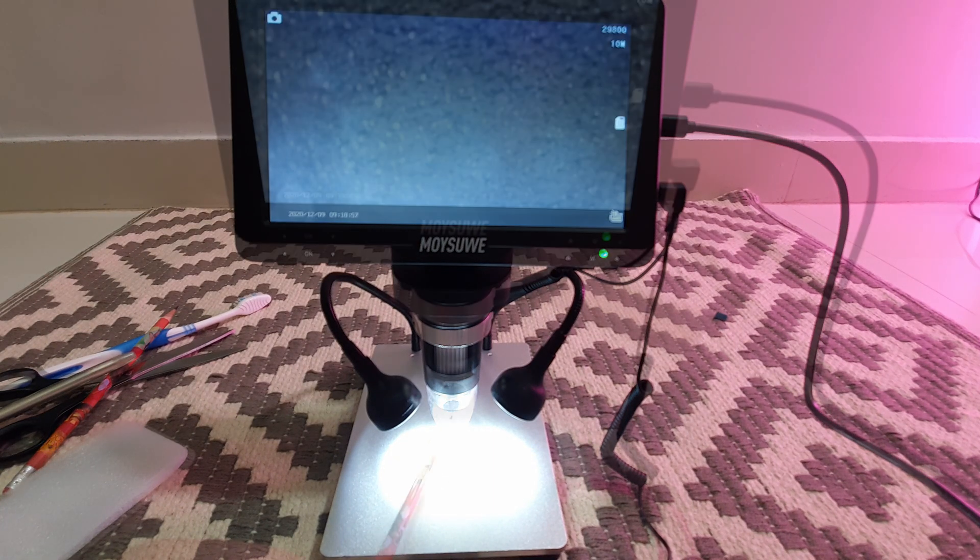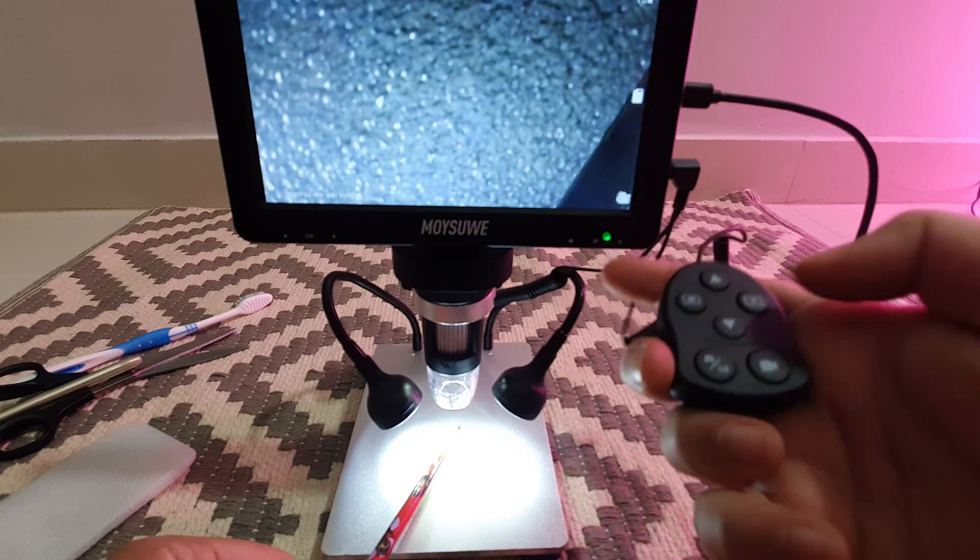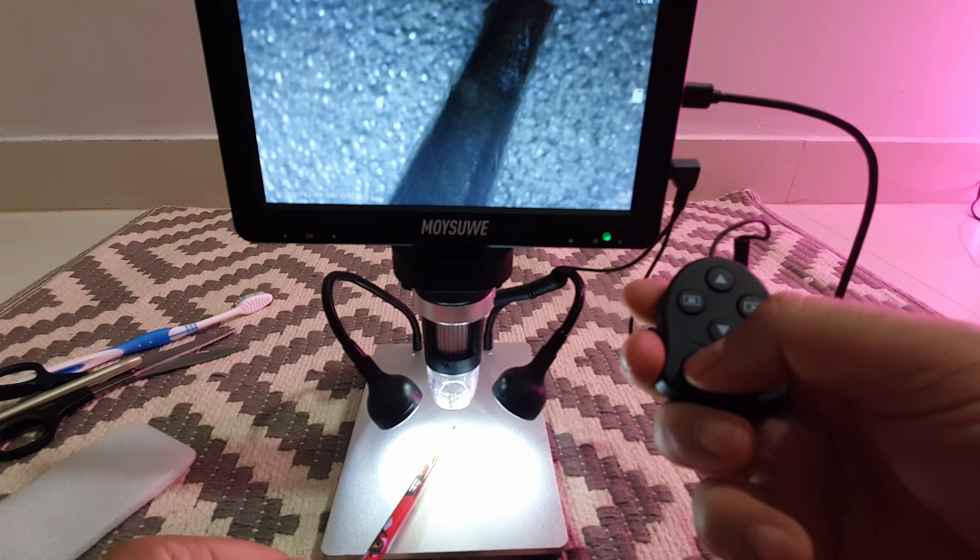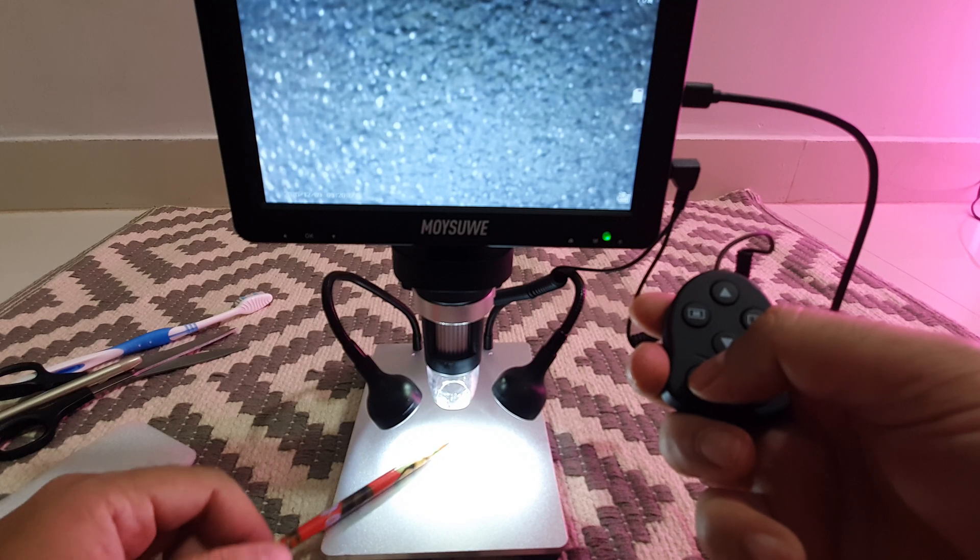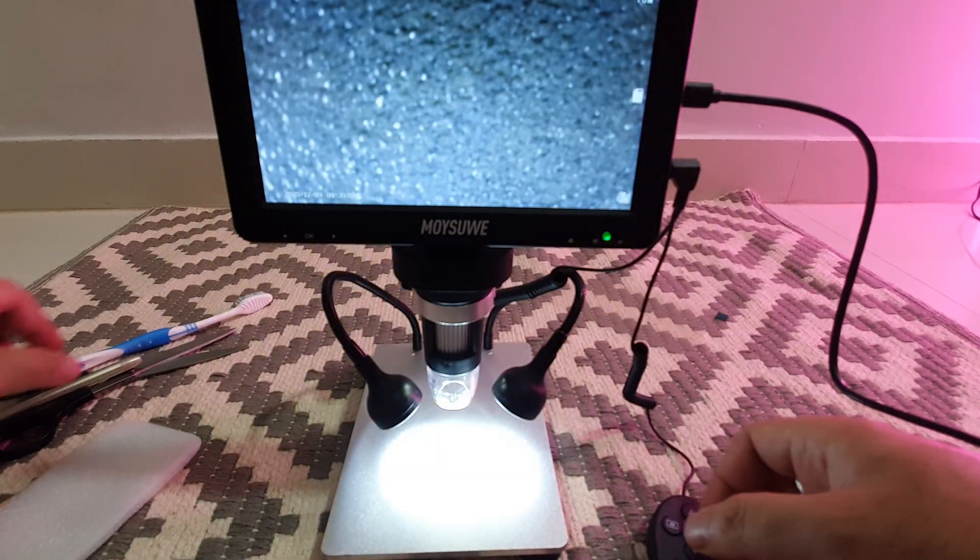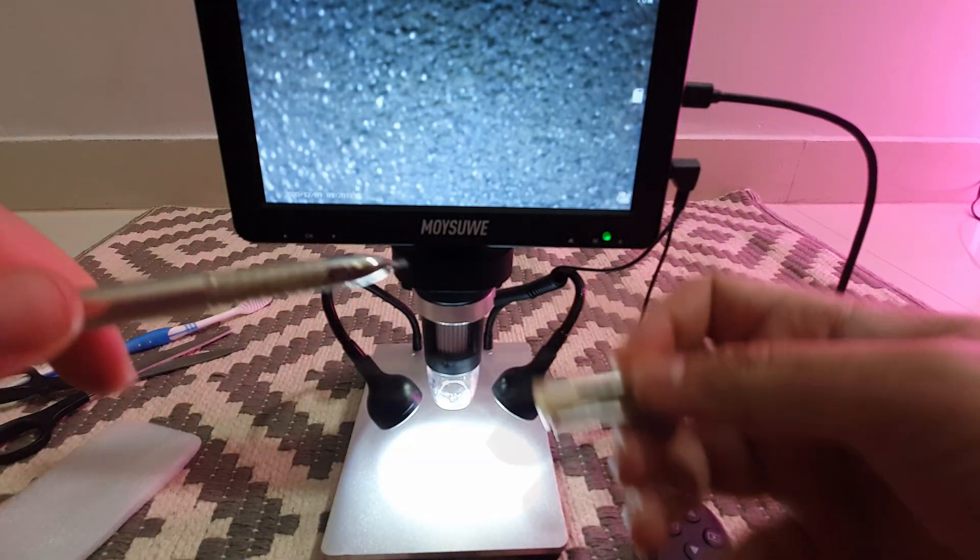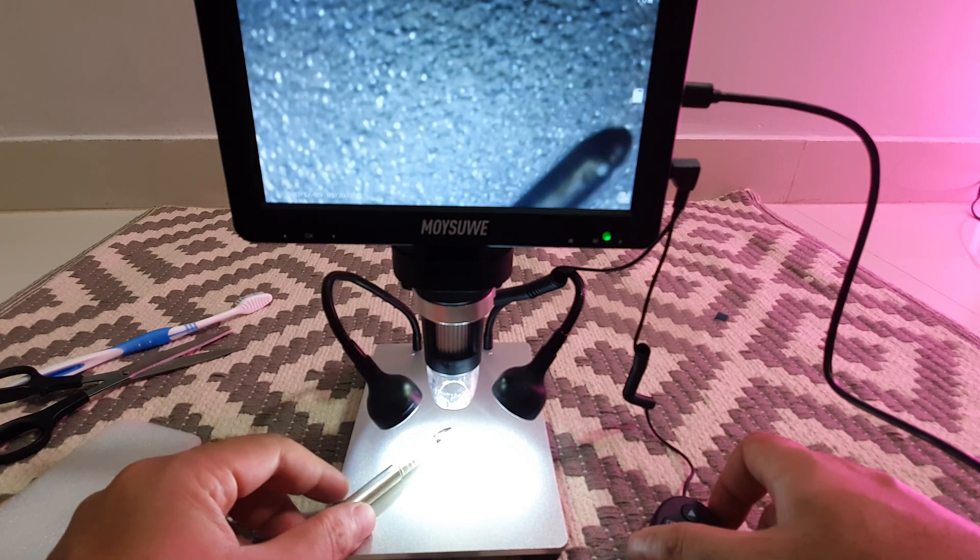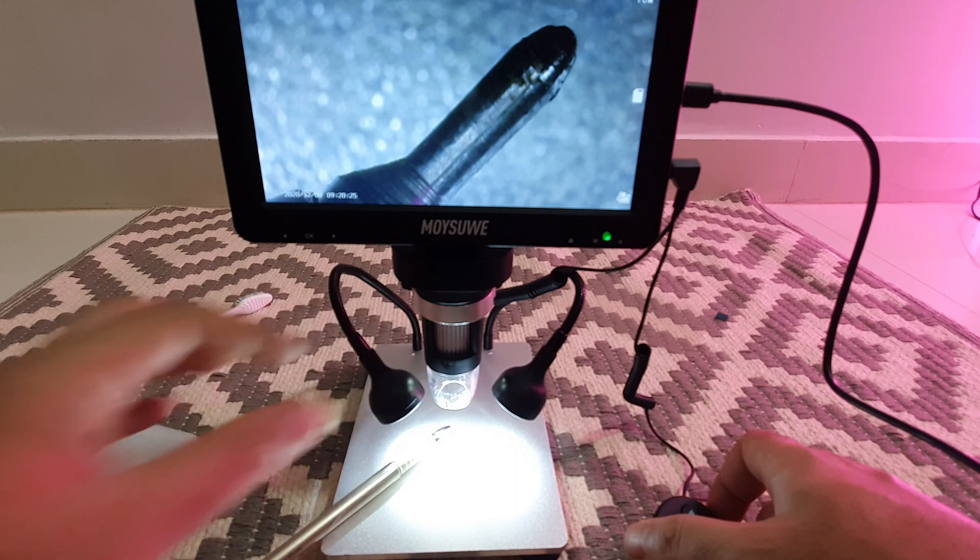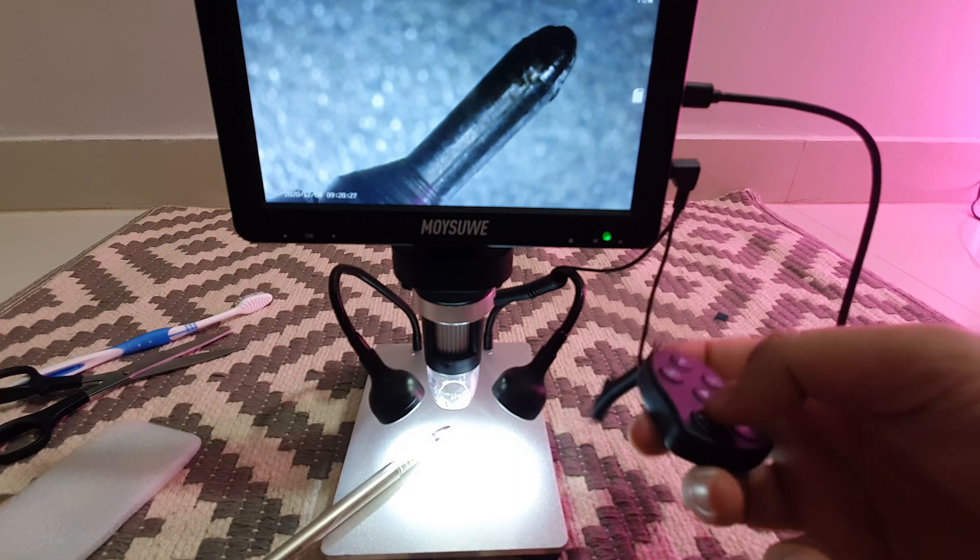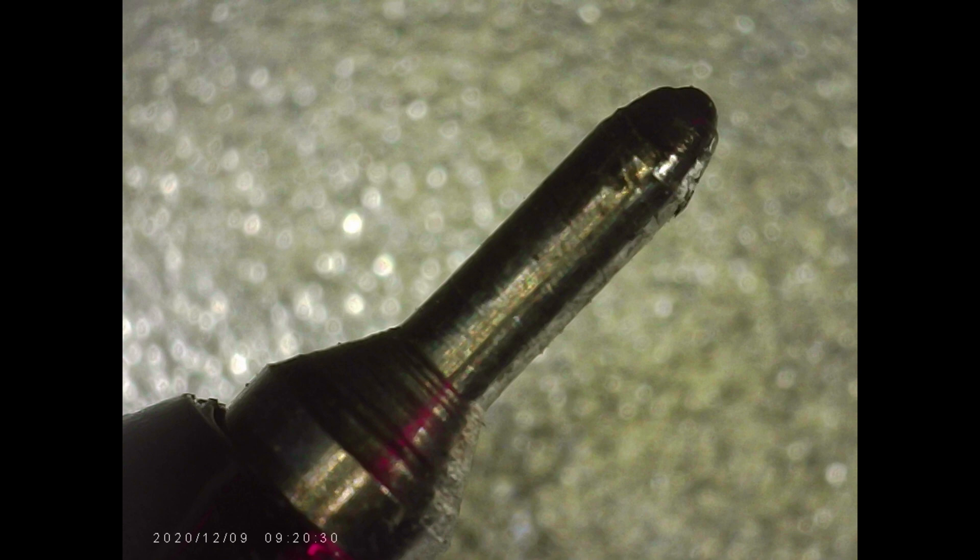Here are some items I'm going to put under the microscope. Here's a pencil tip. I'm going to show you the image as captured by the micro SD card now. There you go, that's how clear it is. Let's put in a pen here and let's see what it captures. Yes you can actually see the tip of the pen very clearly. Thanks to those lights and the stability of this thing really helps you capture things much easier than some of the past microscopes I've seen.